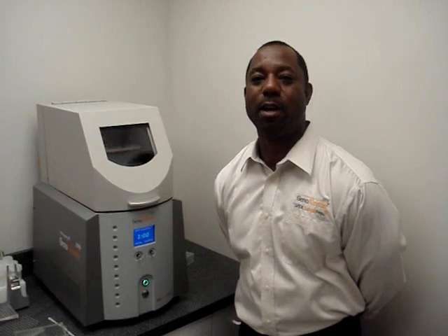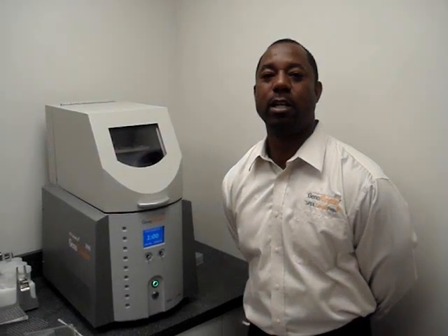Hello, my name is Keith Tucker. I'm with Spex Sample Prep in Metuchen, New Jersey. Today I'm here to introduce our new 2010 Geno Grinder, the ultimate in sample preparation for high throughput plant or animal tissue homogenization.